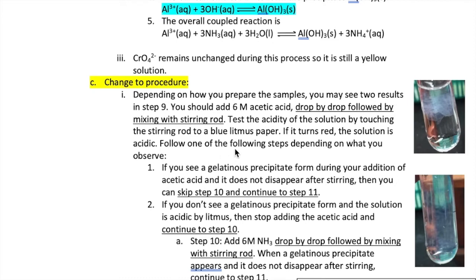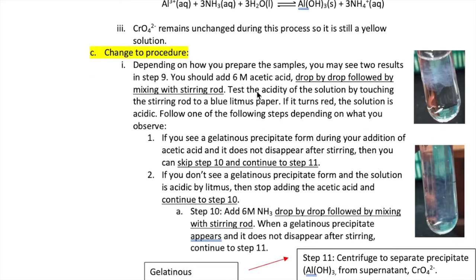If you don't see a precipitate when you're adding your acetic acid, then what you want to do is touch your stirring rod to a blue litmus paper to see if the solution is acidic. If it's not, what you want to do is repeat adding another drop of acetic acid, mix it, and then check again for the precipitate. Again, if you don't see any precipitate, you're going to touch your stirring rod to a blue litmus paper to check for the acidity of the solution. You're going to keep repeating that until one of two things happen: either you see a gelatinous precipitate or the solution becomes acidic by litmus.